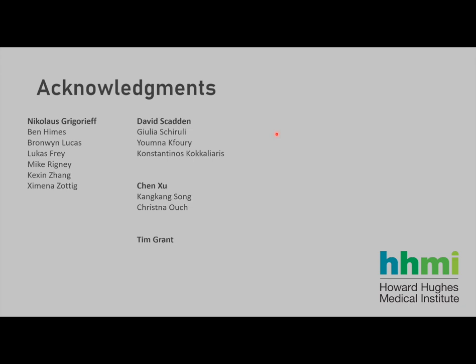Of course, it might be different for every sample, right? In practice, I feel like it is very hard to control the defocus that well anyway. So I think everything between half a micron and 1 micron, you're fine. I don't think the reliance on low defocus is as strong as we initially thought. You can definitely match very well at data that's at 1 micron defocus and even higher, which is sometimes nice because it's easier to maintain a higher defocus and you get more contrast from the image.